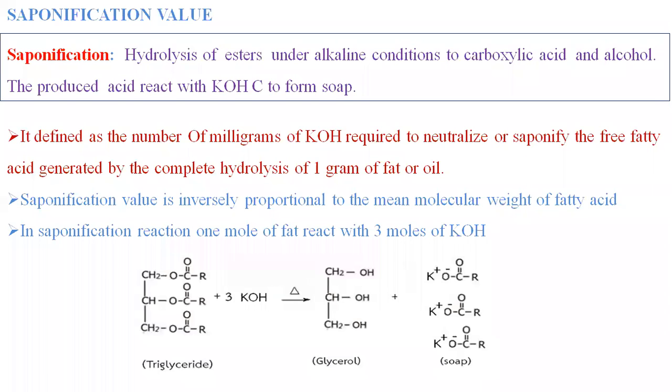Saponification value. Saponification is nothing but hydrolysis of an ester under alkaline conditions to a carboxylic acid and alcohol. Here the ester is nothing but the triglyceride fat.